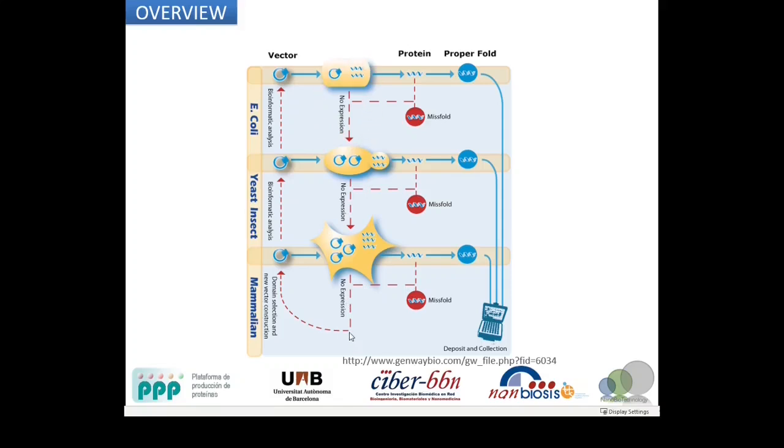The recombinant gene needs to be redesigned using bioinformatic tools, and the process starts all over again in order to obtain the properly folded conformation of the protein.